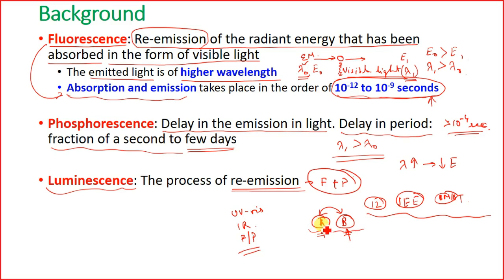In the molecular region also it is the same. Molecule A is different from molecule B. Either the absorption spectra, or if it is a fluorescent molecule, the fluorescence or phosphorescence, all of these will show some absorption spectra. In addition to that, A and B may show phosphorescence or fluorescence properties.